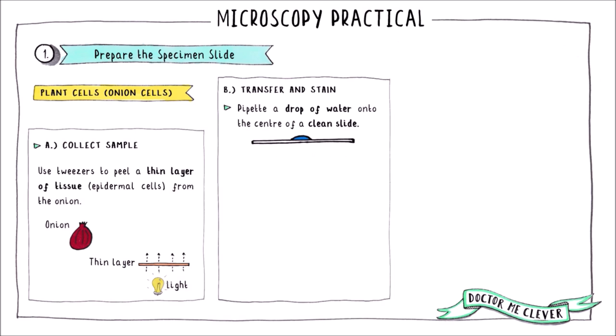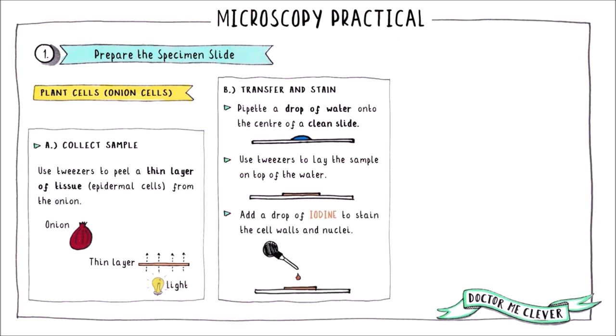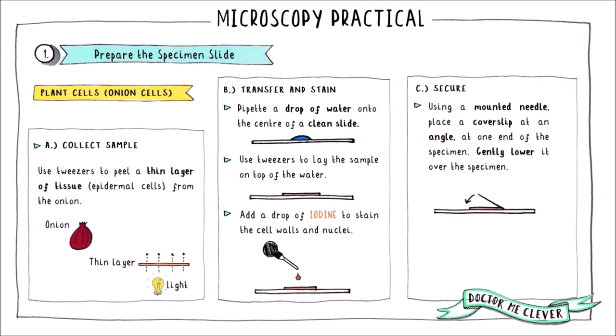To do this, prepare a drop of water onto the center of the slide and use your tweezers to lay the sample of onion tissue on top of the water. Then add a small drop of iodine to the onion cells — this will make the cell walls and nuclei more visible when you view the sample down the microscope.